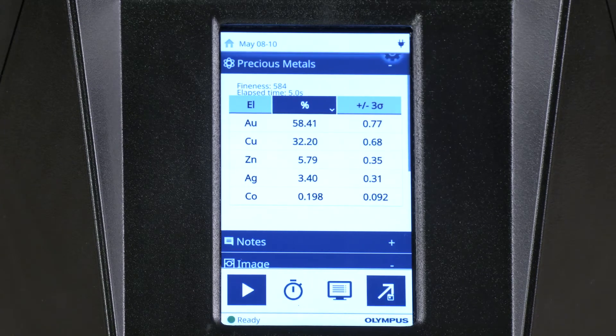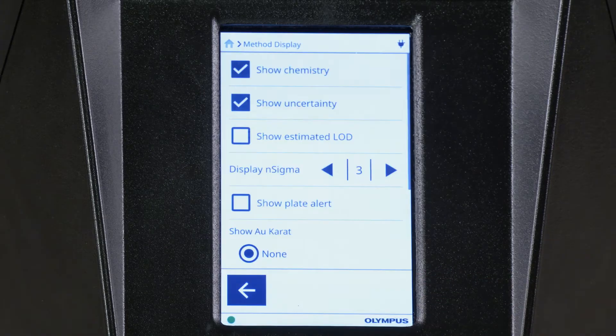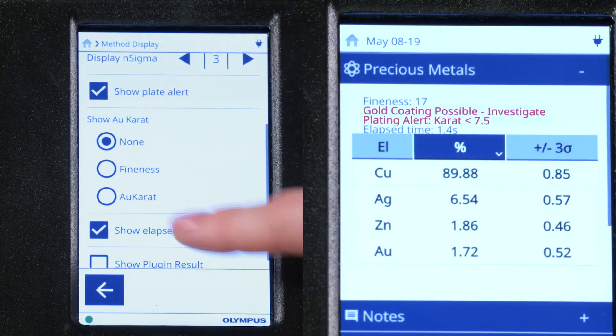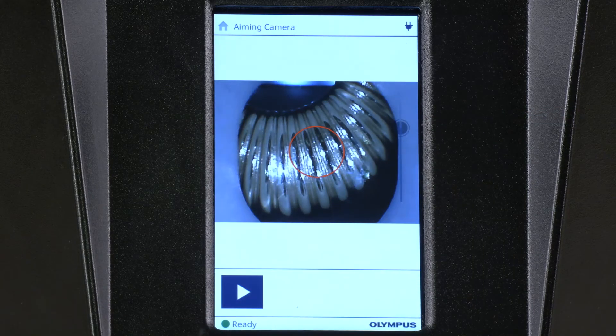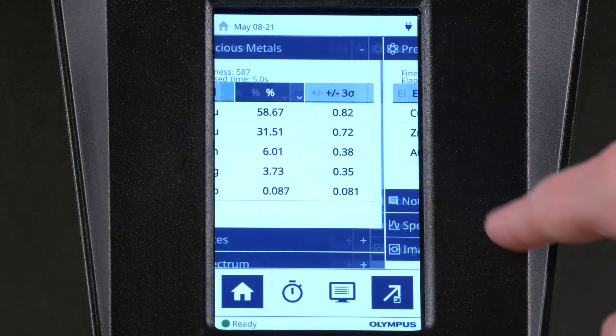Let's review the results. The Vantage EX Analyzer can be configured to show the karatage or fineness of gold. An alert tells you if the item is gold-plated. Scroll down to view additional information. Swipe left to access the aiming camera, where you can see an image of the item tested. Swipe right to access the previous test results.